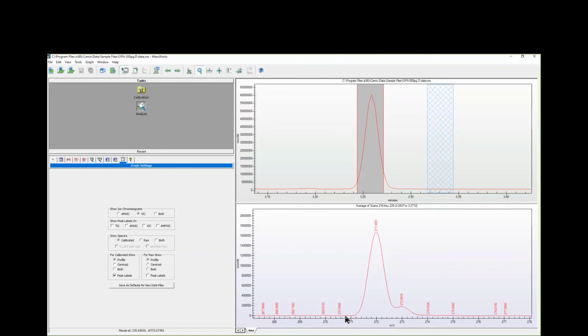That's why, even though obviously it's a lot easier to do, and you can always do a better job if you have higher resolution, we can do quite an admirable job on low resolution by doing our peak matching and centroiding based on this known line shape to give us high mass accuracy. So that's an important thing to remember.